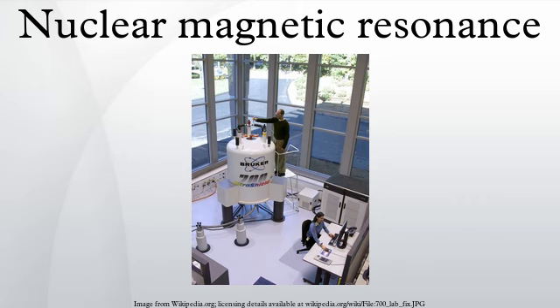Isotopes. Many isotopes of chemical elements can be used for NMR analysis. Commonly used nuclei: 1H, the most commonly used spin 1/2 nucleus in NMR investigation, has been studied using many forms of NMR. Hydrogen is highly abundant, especially in biological systems. It is the nucleus most sensitive to NMR signal. Proton NMR produces narrow chemical shift with sharp signals. Fast acquisition of quantitative results is possible due to short relaxation time.